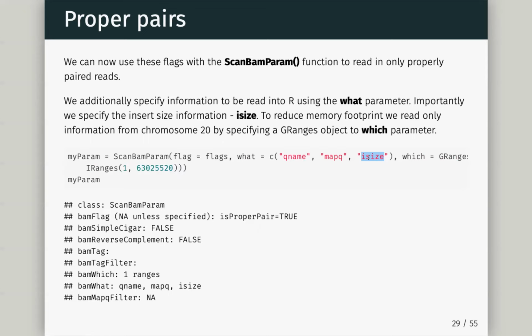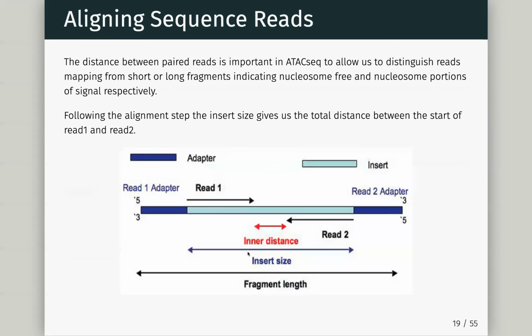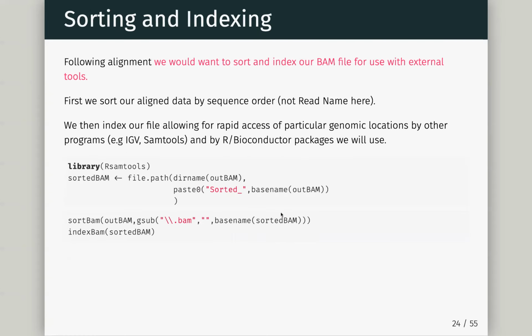Okay, so that's going to be, come back, this size. How long is this fragment we actually sequenced? Right? And we can find that out from knowing where read 1 and read 2 align in the genome.